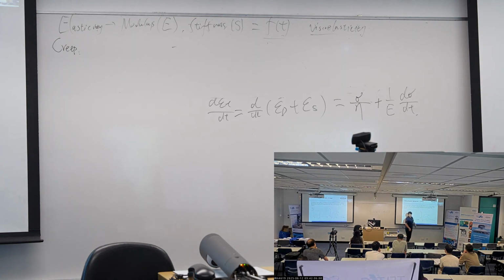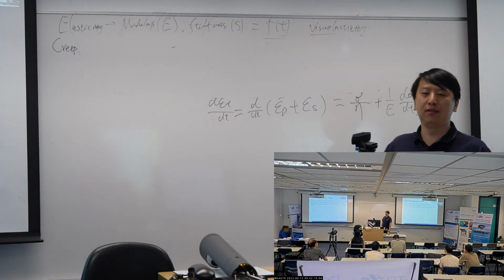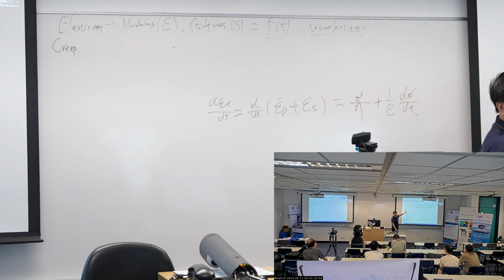And then, since it shows viscosity, the epsilon should change along the time. That's his idea for this creep deformation.